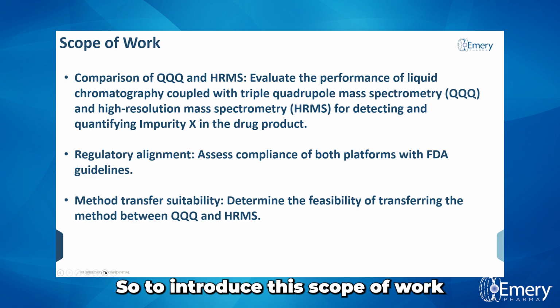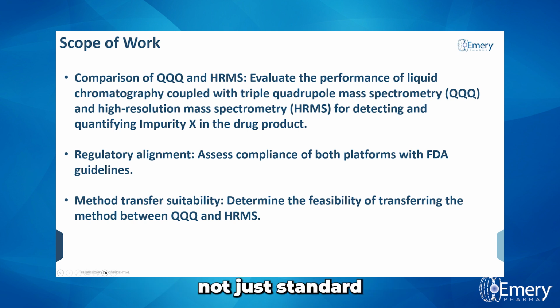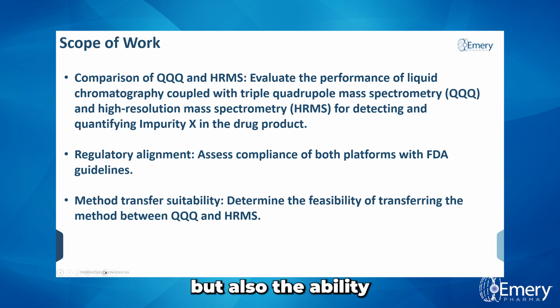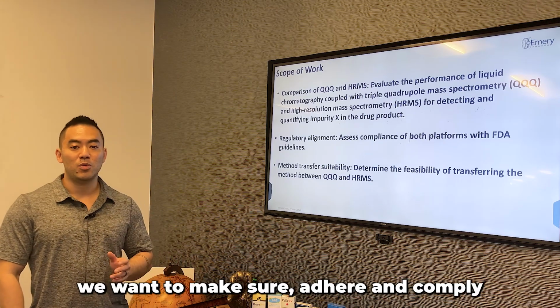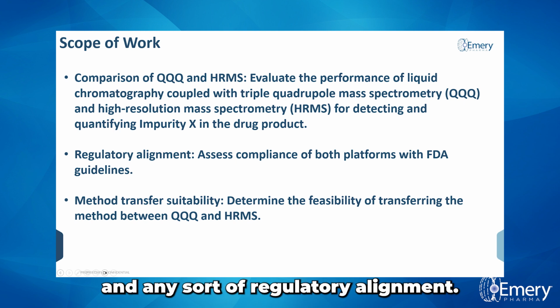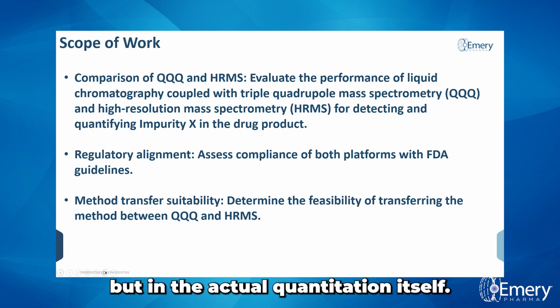So to introduce the scope of work for this case study, we are ideally trying to compare these two different technologies. We're evaluating not just standard performance parameters such as linearity, accuracy, and precision, but also the ability to detect and quantify specific impurities within drug products. Both of these methodologies we want to make sure adhere and comply with FDA guidelines and any regulatory alignments. And lastly, we want to determine if both of these instruments perform the same, not just in those parameters, but in the actual quantitation itself.